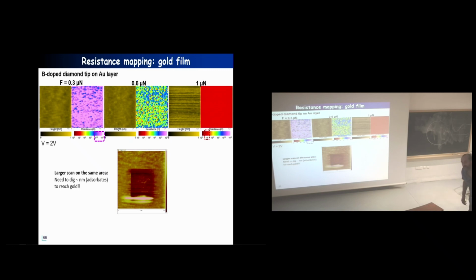About this measurement, first line. So you apply 2 volts, yeah, with a resistance of 10 to the power 4 ohm. Yeah, this is 0.1 milliamp, probably. Yeah. Do you really drive a current of a milliamp? Yeah, this is the limit.